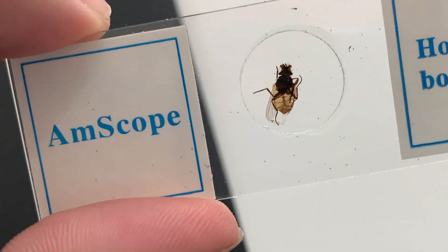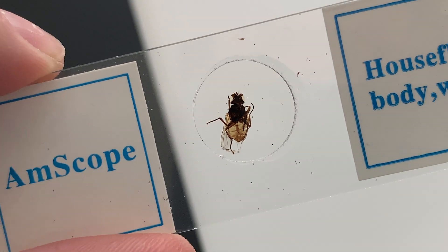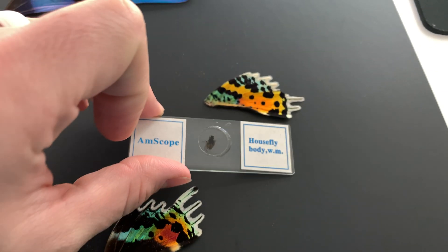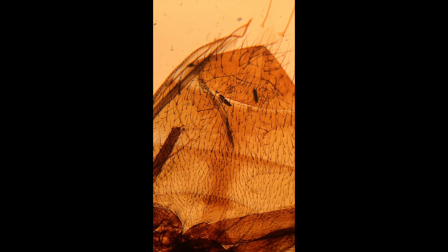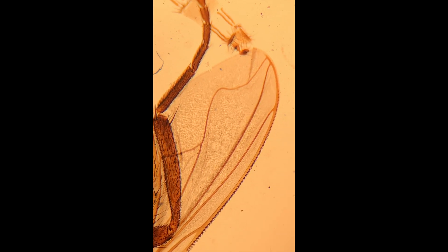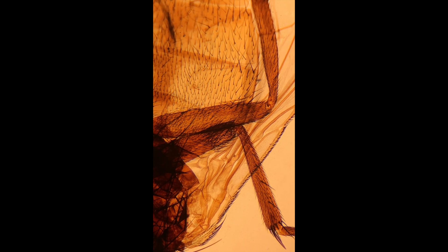I had this other slide from Amscope as well, and this is an entire housefly. I tried to zoom in as much as I could with the phone and you can see some pretty good detail if you zoom in right enough. And then I also just sat it down right next to this wing for comparison. I never really thought that flies were as hairy as they were, but they've got lots and lots of hairs.